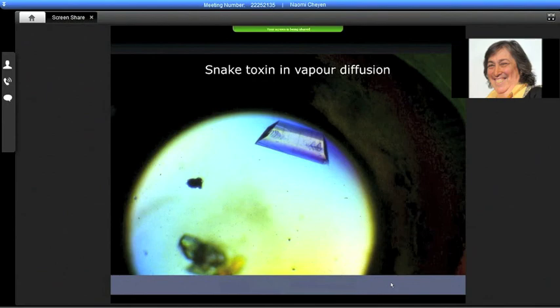Now, of course, in the oil, the dioxane didn't work because this is a small organic molecule, and it ran away into the oil. So it couldn't be crystallized in oil, and you had to go back to vapor diffusion. But here one had the best of both worlds, because one could screen using microbatch, with very small quantities, get a hit, and then take it to vapor diffusion and optimize it there.